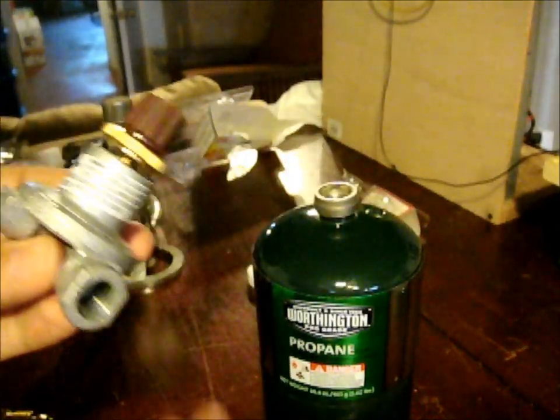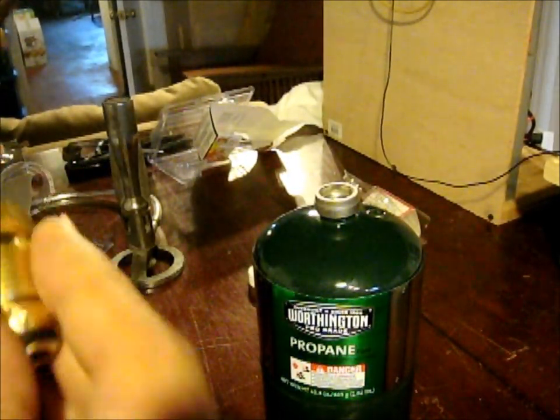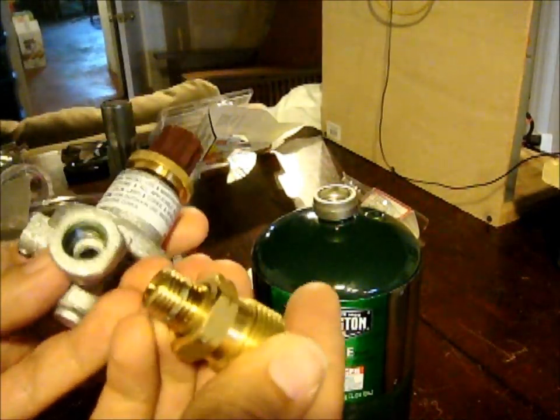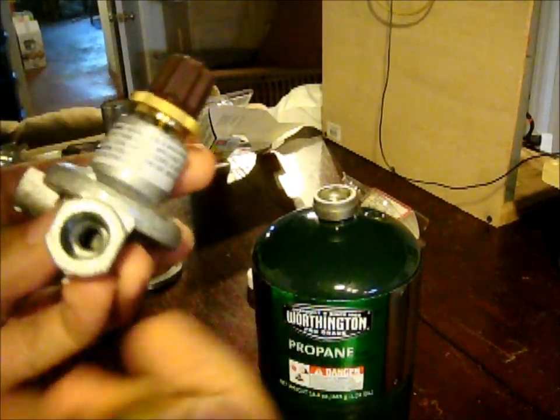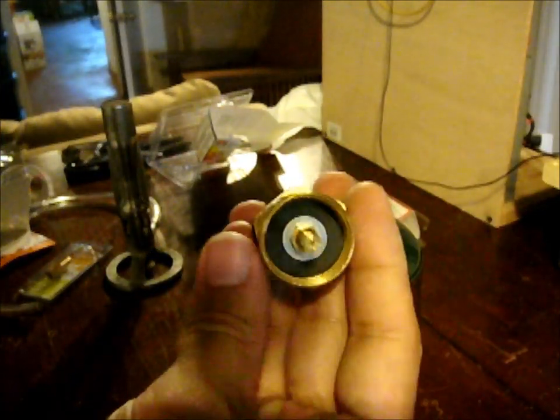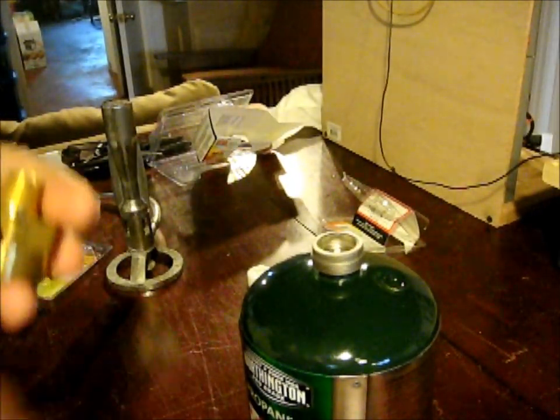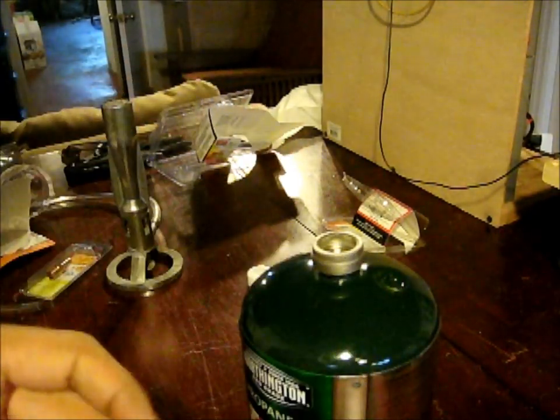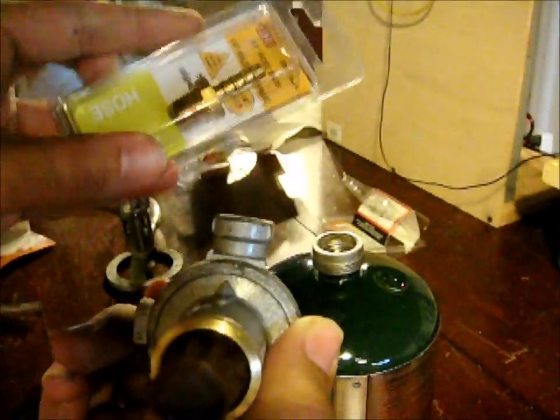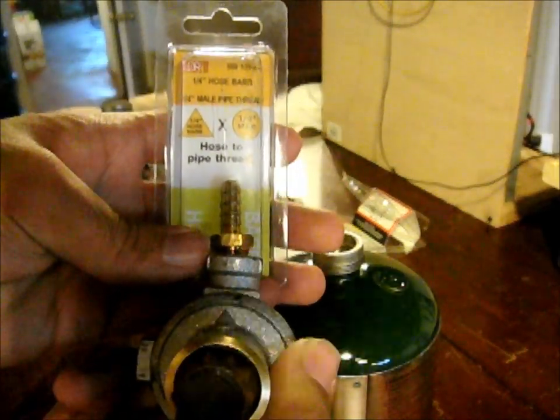Getting the regulator ready. It actually came with a fitting built in, but be sure you have some wrenches handy because this is hard to get out — they put some kind of Loctite or something in there. I need to remove this fitting so I can put on my propane bottle fitting. Then I'm going to put on my yellow Teflon tape, attach the barb to the regulator. A little arrow indicates the outflow of the propane gas that will go to my Bunsen burner.